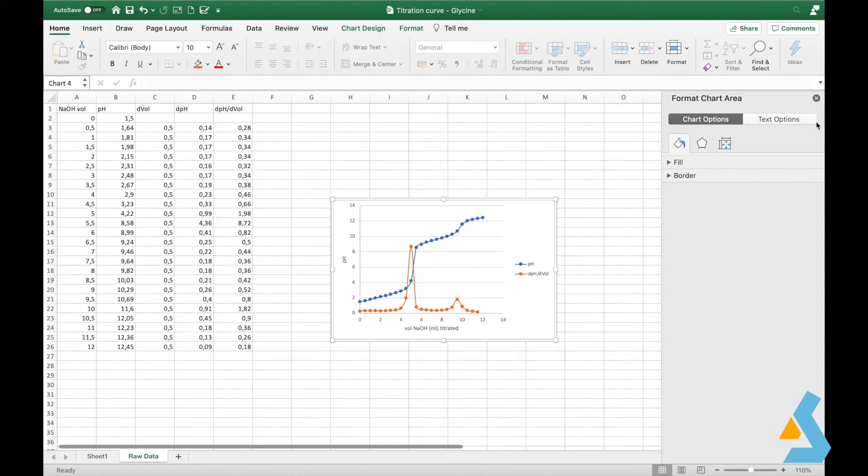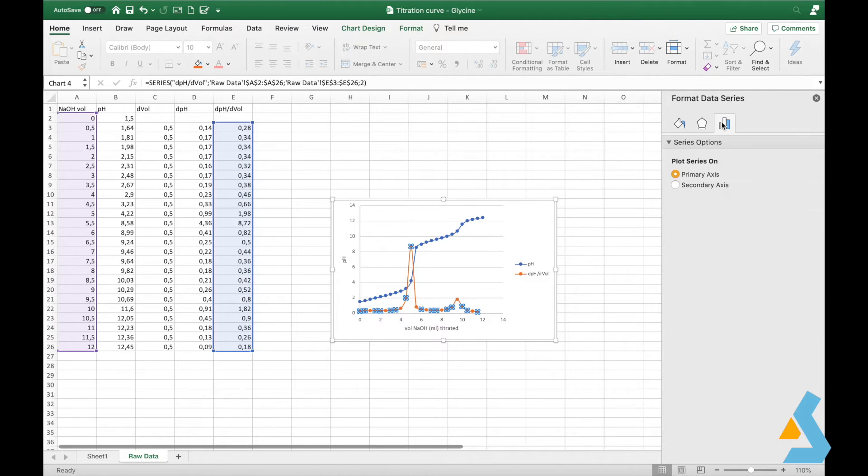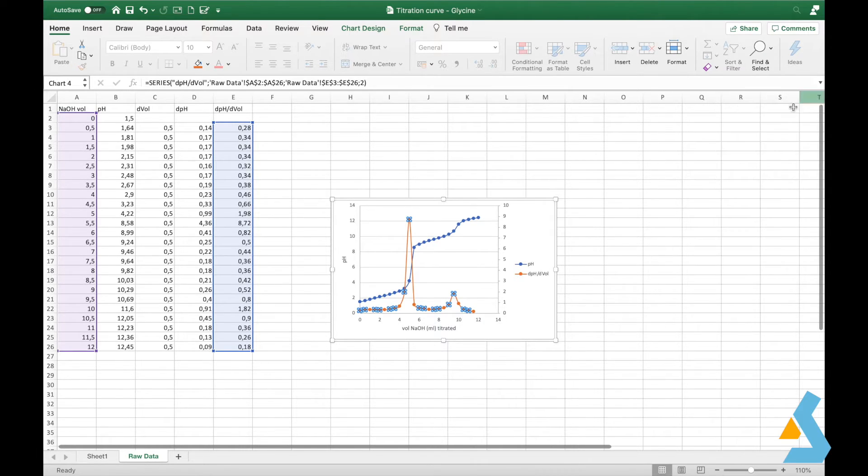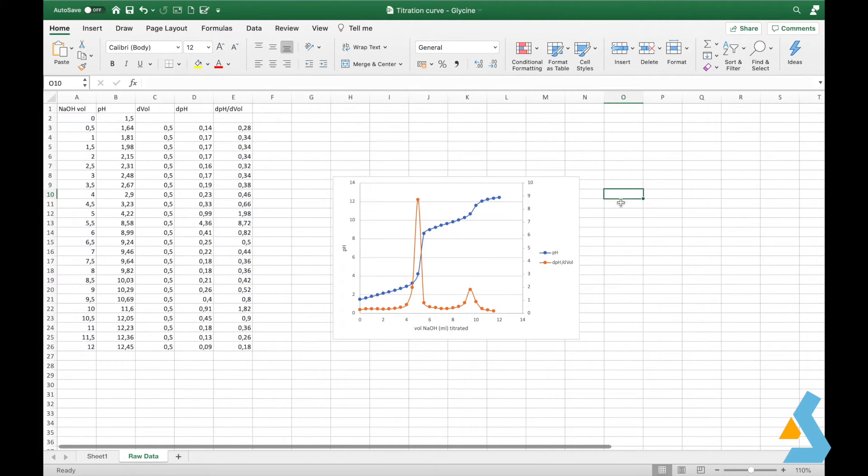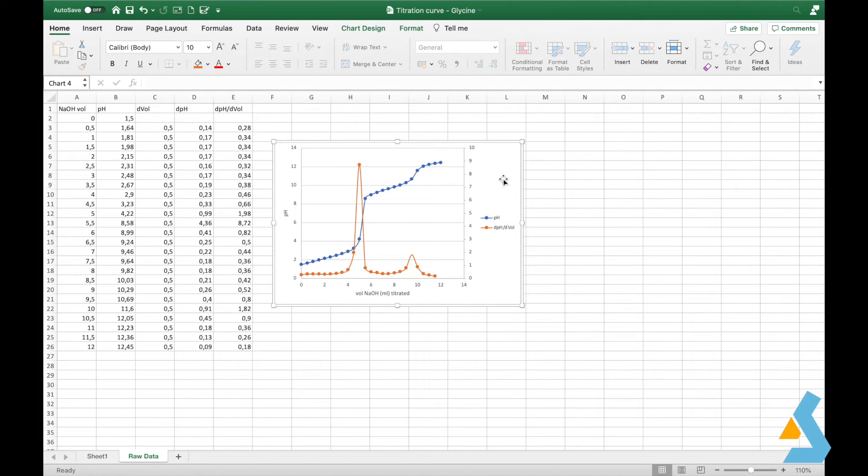In order to interpret your new curve better, you can add a secondary y axis. Just click format and go to plot series on secondary axis. The peaks we see in this derivative plot show us the equivalence points. We have two easily visible peaks.